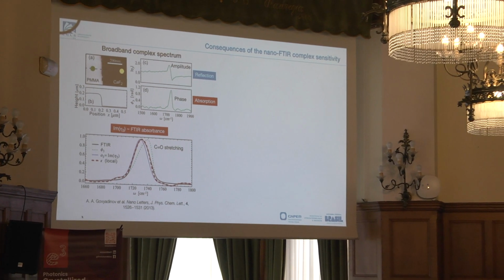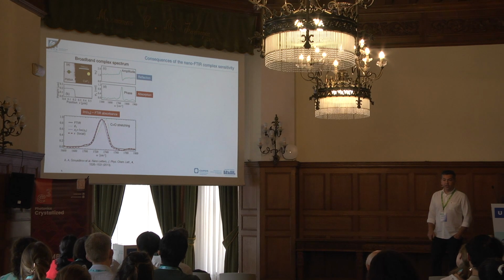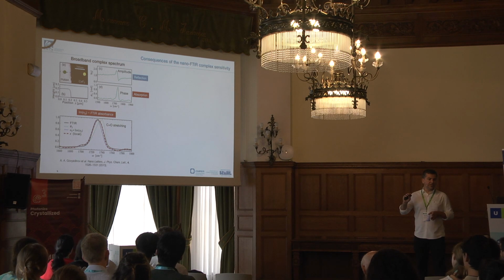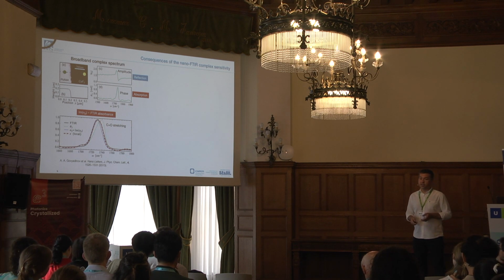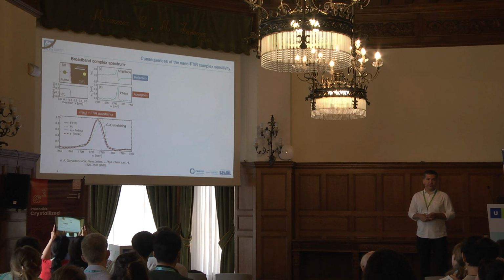This work here is a very good work that shows the correspondence between the nano-FTIR absorbance and the far-field FTIR absorbance. This is really important for people to use, at least for these weak scatterers, as a real tool for spectroscopy.